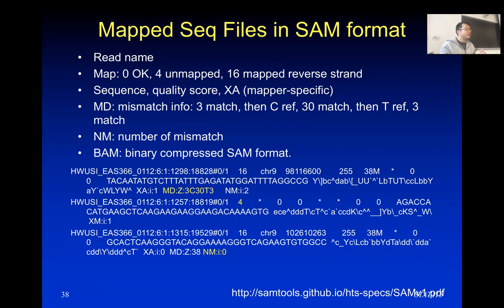And each read will have one entry in the SAM format, and it will look like this. There are some important columns in the SAM format.